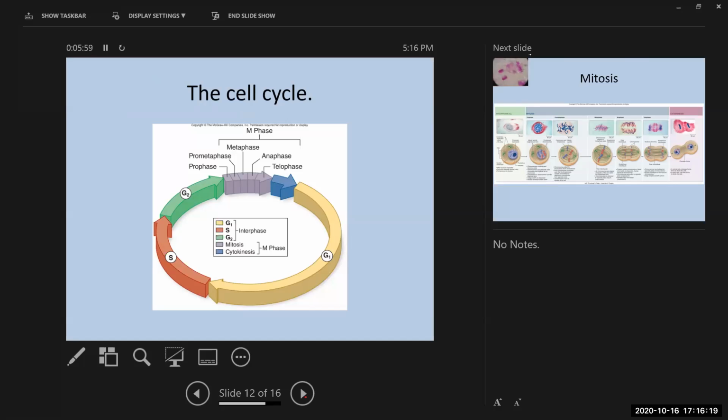All right, so mitosis. For today, in your lab report, you're going to talk just a little bit about the theory behind microscopy. We've talked about how there are different lenses of different magnification strengths, and we're going to use a combination of those to look at our object on a stage. The object that we're going to be looking at today are onions.